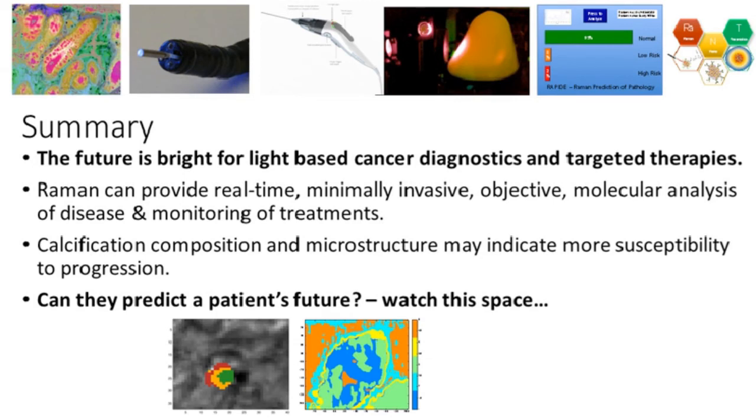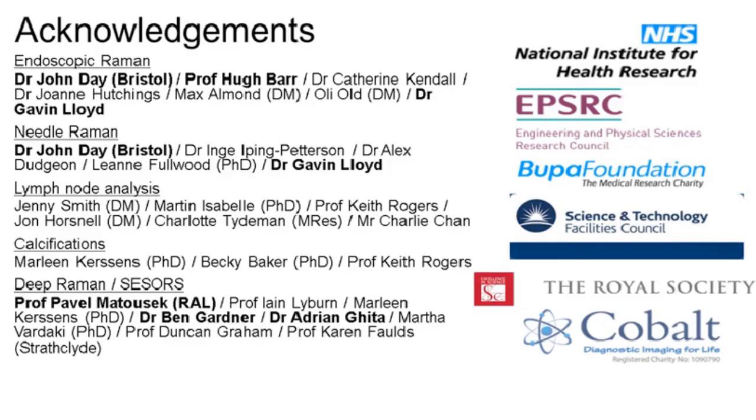We're currently part of a study, a grand challenge funded by Cancer Research UK, which is looking at the Raman signatures of the breast calcifications. And at the early stage, we appear to be able to indicate the likelihood of individuals going from ductal carcinoma in situ, picked up at mammographic screening, which is the non-invasive cancer or condition in the breast, identifying the difference between those patients that go forward and develop invasive cancer. So keep an eye on the work that we develop, and we'll be publishing that next year as well.